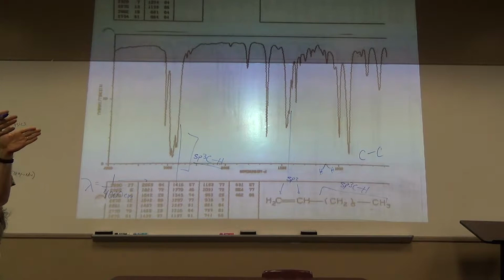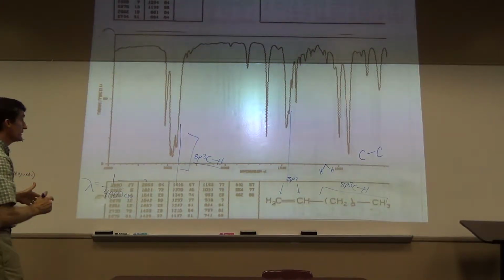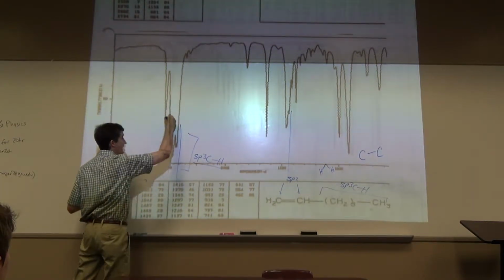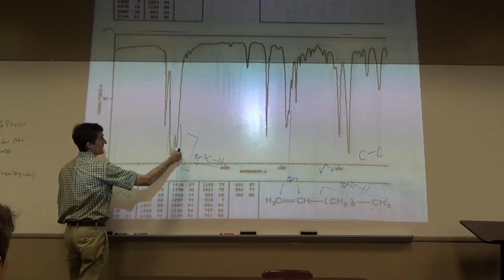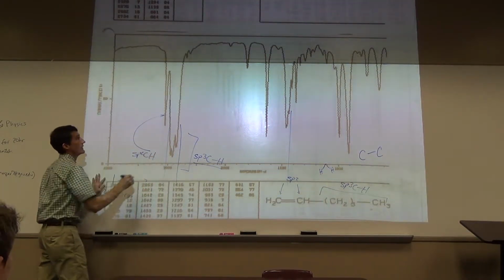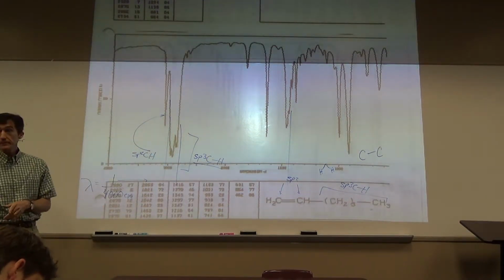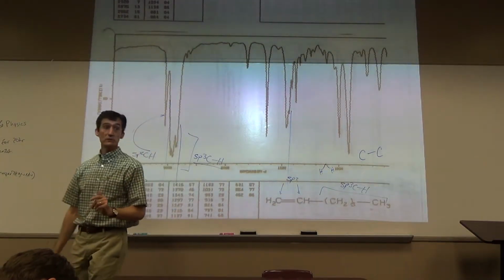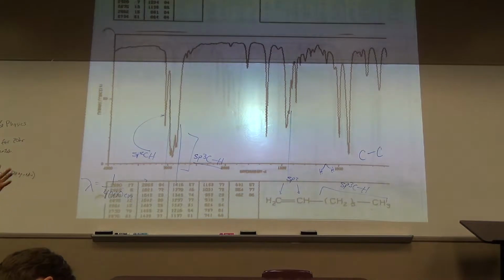Yeah. You see it's just above 3,000, up to 3150. Do we have a peak that's above 3,000? Magical line I would draw. We got that, and what do we have here? It's actually just one peak, even though there are 3 sp2 C-H bonds. Again, you can't quantify.